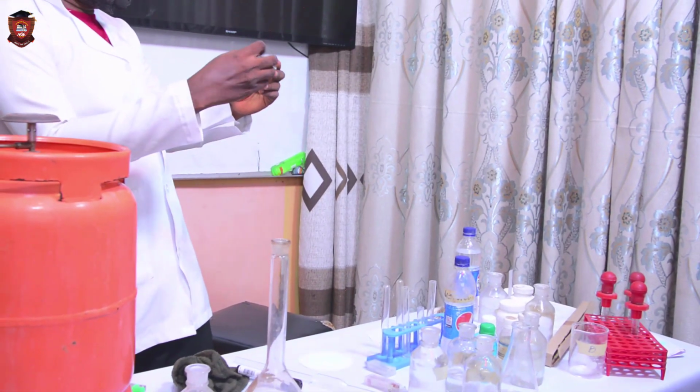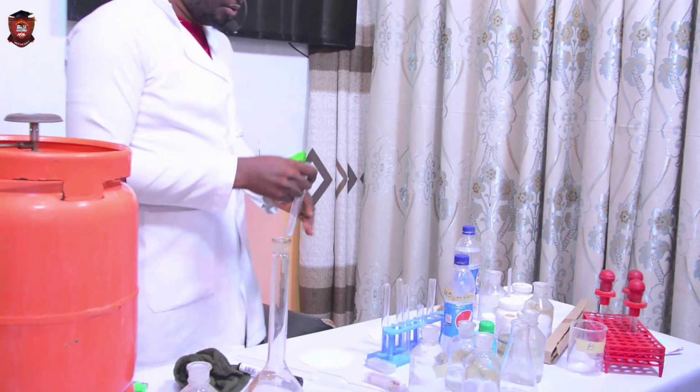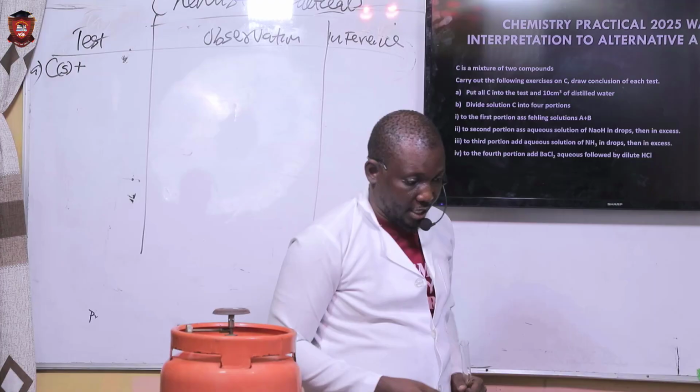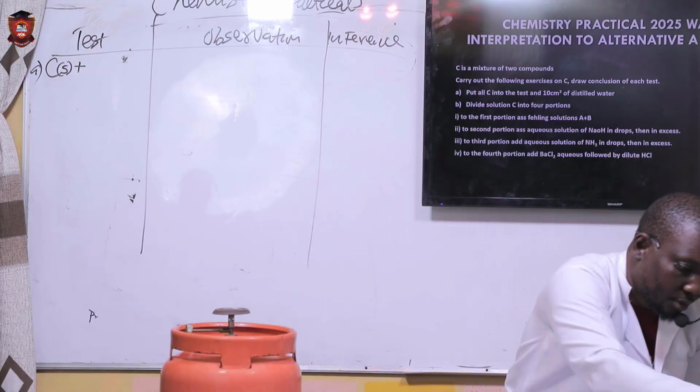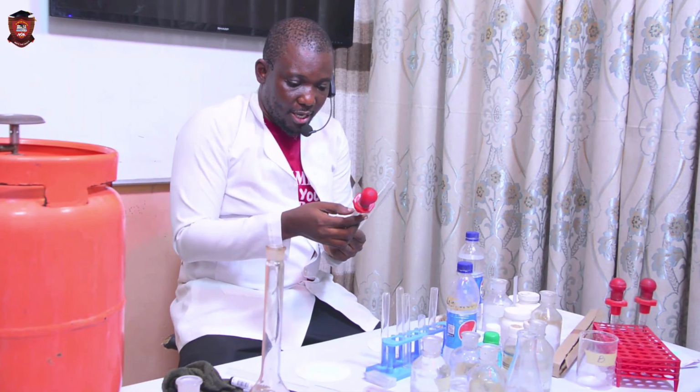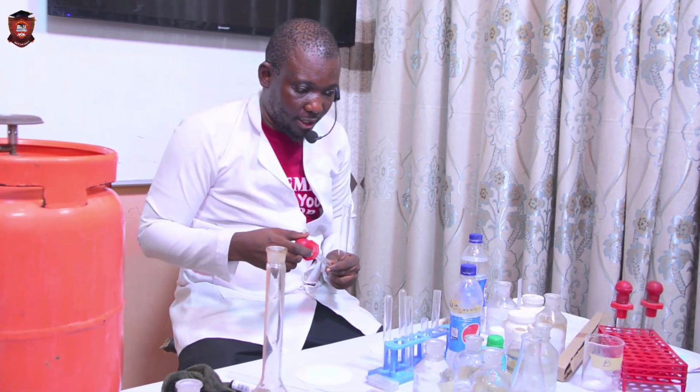Okay, the sample this can do, and then we are asked to add 10 cm. If you didn't see anything to measure 10 cm, you can just add. Okay, this is 8 cm, so I can add 8 and take 2 later.